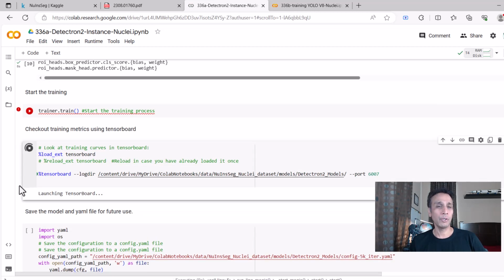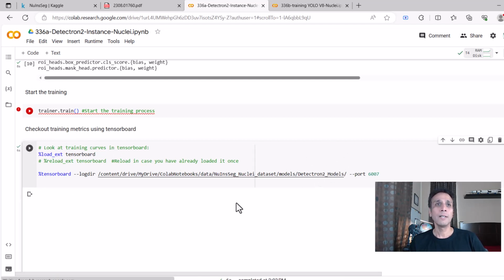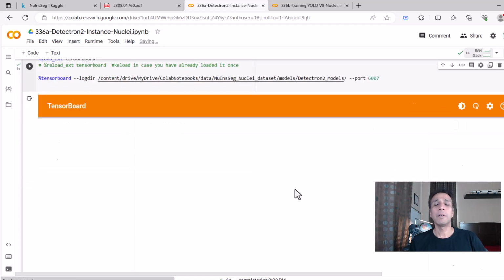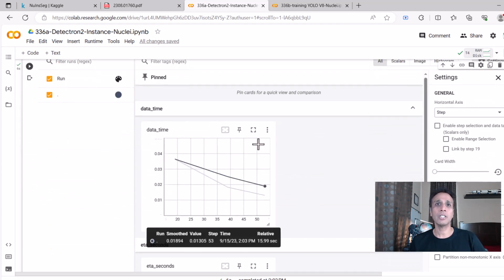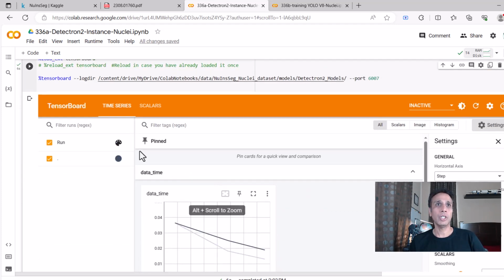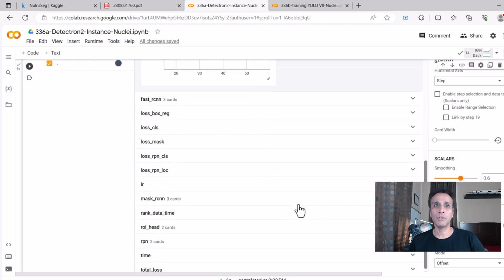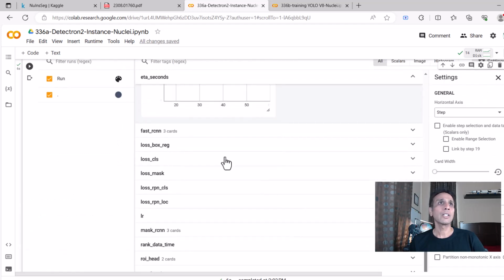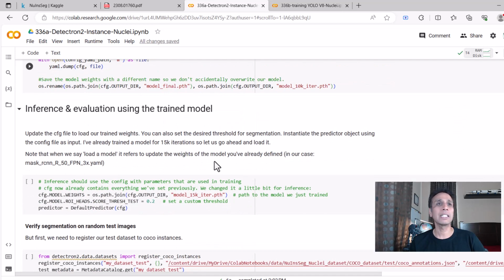And you can load the TensorBoard if you want. And because I have trained it earlier, this should show me the earlier logs. Let's see. I mean, in one of my previous videos, I was wondering why the TensorBoard wasn't working, and then it was a silly mistake. The log directory, I was pointing at some other random location. You have to point at the right location. So in this case, it stopped right here, but you can open older ones if you want, and look at the training right here. Okay, so anything else I want to show? Now let's go ahead and close this and come back down.